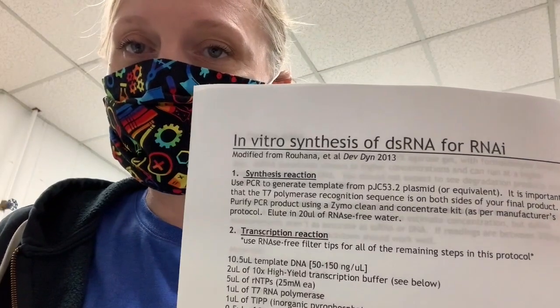All right, so we're back with the second portion of the in vitro synthesis of double-stranded RNA protocol. I have allowed my transcription reactions for the double-stranded RNA to go overnight at 37 degrees. In the protocol, it says you can leave this for 5 hours, and that's fine. So there may be sometimes when you're in a hurry that you want to do all of this in one day, but often I will do the next couple of steps the day after I've set up the synthesis reaction.